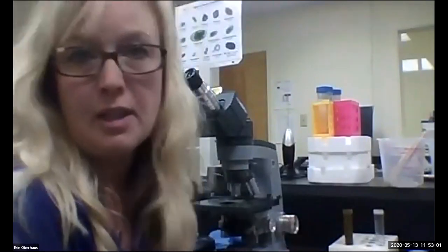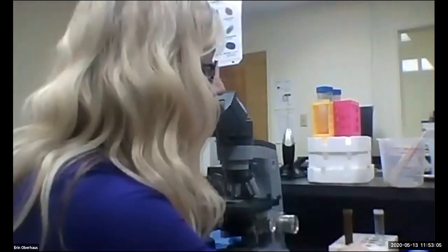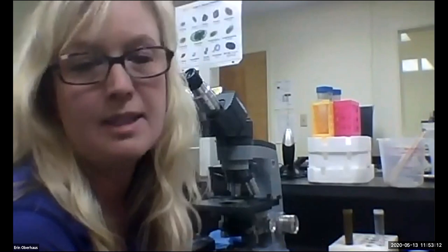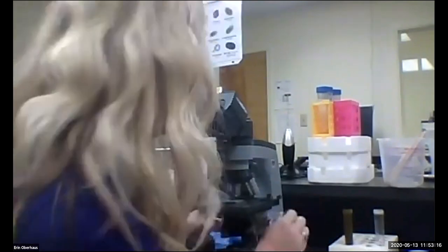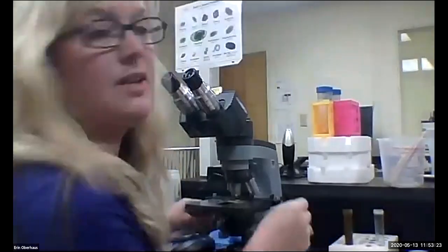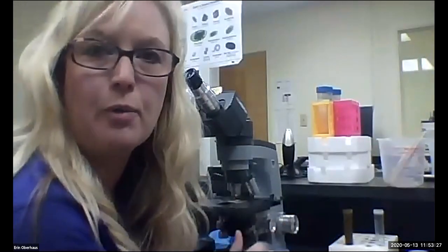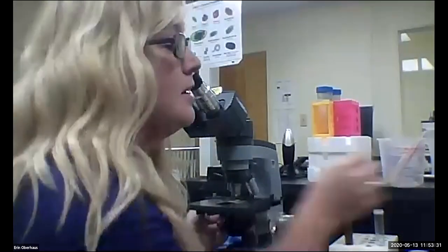If you're just using a cover slip and you don't have the advantage of the grid system on the McMaster slide, then you want to find a methodical way to scan the entire surface of that cover slip and count every parasite egg that you see. My method is usually to start at one of the top corners, and I snake my way from left to right and then back to the left and back to the right, working my way down as I go until I've covered the entire surface of the cover slip.